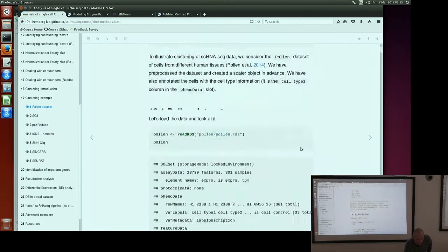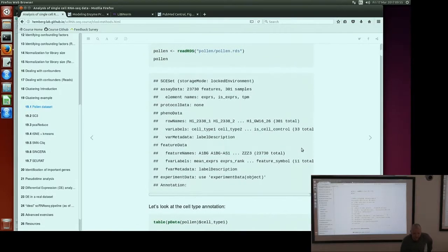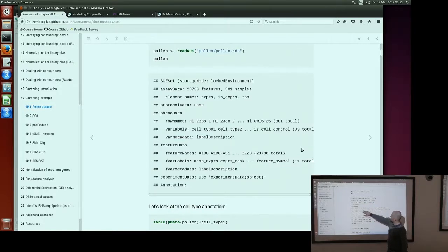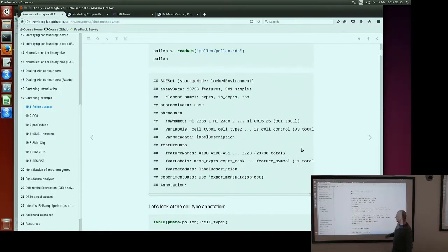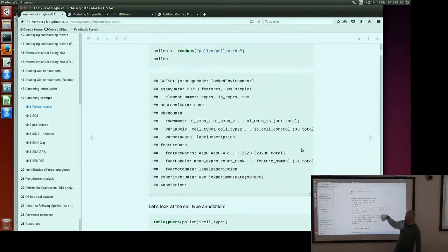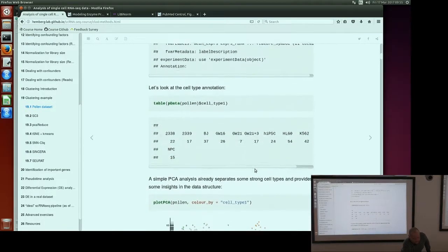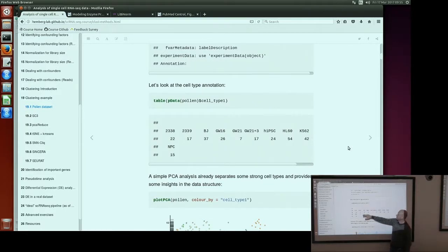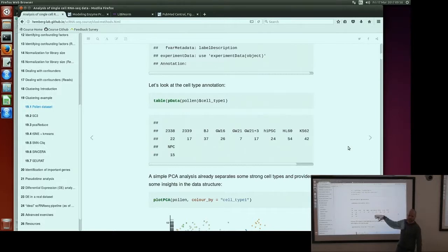Let's go through the analysis. This is our dataset — a SCATER object. We have 300 cells and 23,000 genes. Here we have the cell IDs, the columns from the phenodata table, and the gene names from the feature data frame. When you just type the SCATER object name in R and press enter, it shows you quite a lot of information. If you look at the cell type column, these are the cell types reported by the authors, and this is the number of cells in each cell type. In total we have 300 cells spread over different cell type categories.